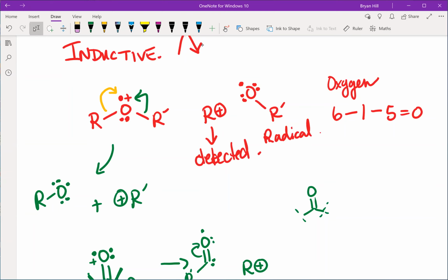And then we would use the infrared and in the future NMR to dig down to what we're looking for. But I wanted to show some of the ways that molecules fragment, and that can give us some clues with regard to some of the structural features or what functional groups we've got. But anyway, we'll get into that on Thursday.